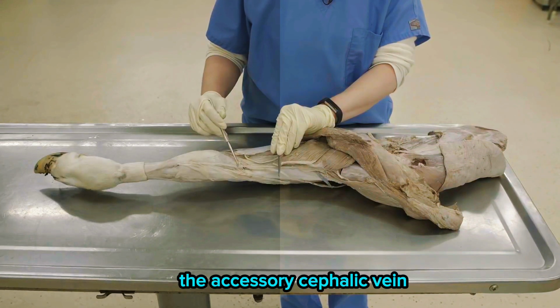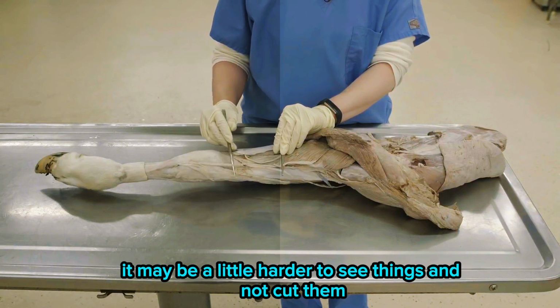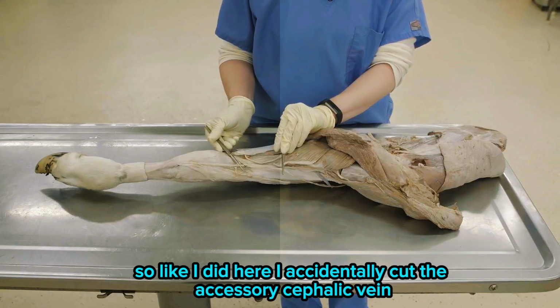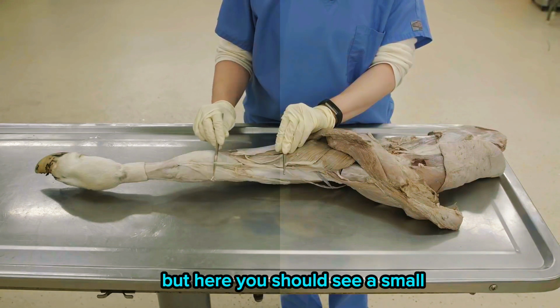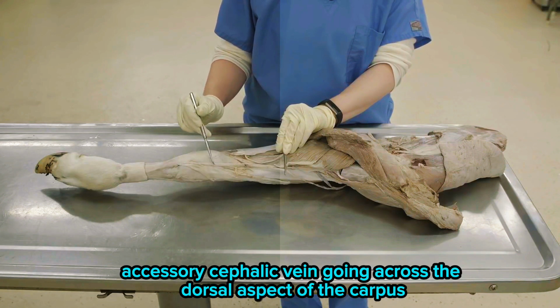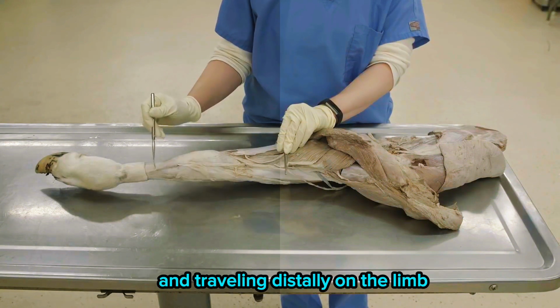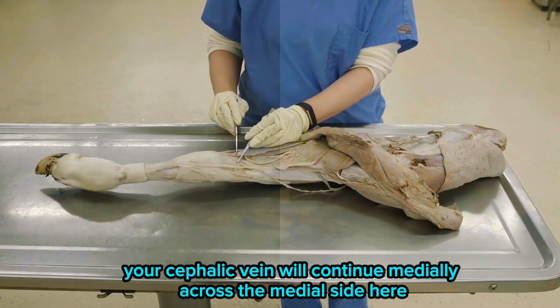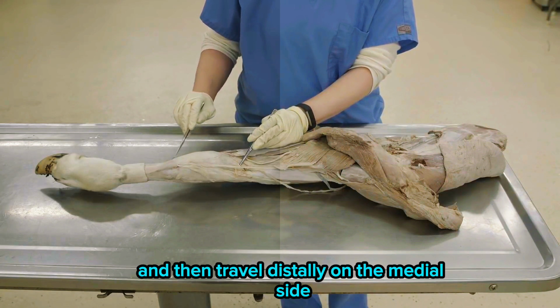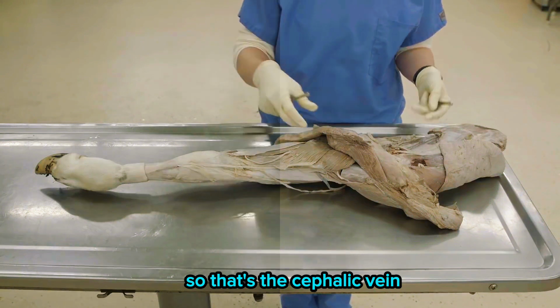the accessory cephalic vein. So on the calves, it may be a little harder to see things and not cut them. Like I did here, I accidentally cut the accessory cephalic vein and had to suture it back together. But here you should see a small accessory cephalic vein going across the dorsal aspect of the carpus and traveling distally on the limb. Your cephalic vein will continue medially across the medial side here and then travel distally on the medial side. So that's the cephalic vein.